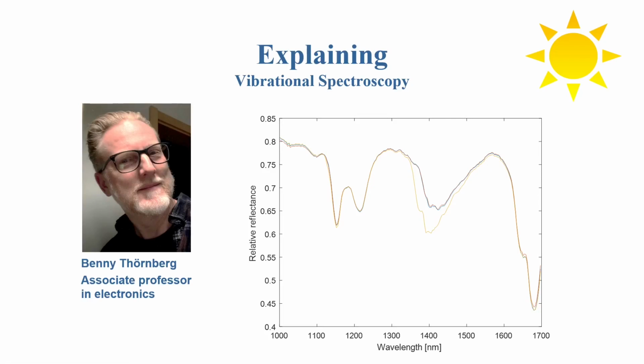I am now planning to explain to you in the simplest possible way the method of using infrared illumination in order to analyze the presence of molecules in a material. It is a method called infrared vibrational spectroscopy, commonly used in the chemistry labs. But we researchers in the electrotechnical area are also interested in this for various types of applied sensors.